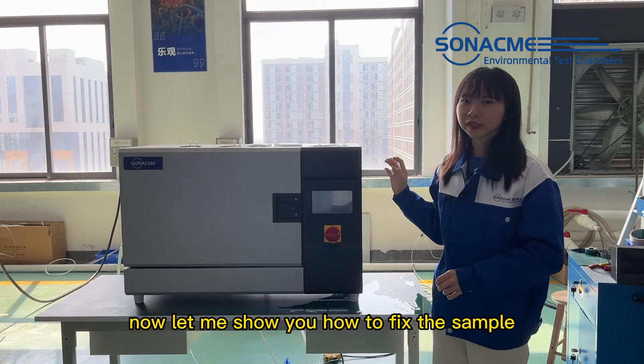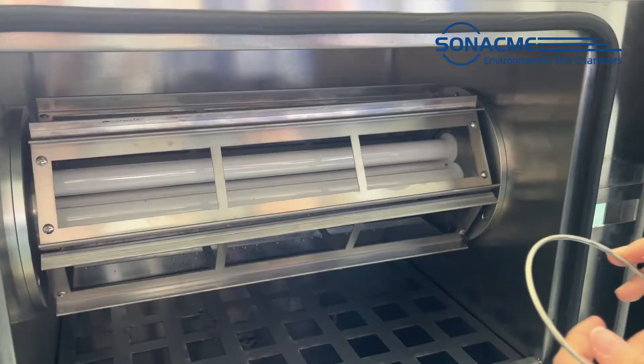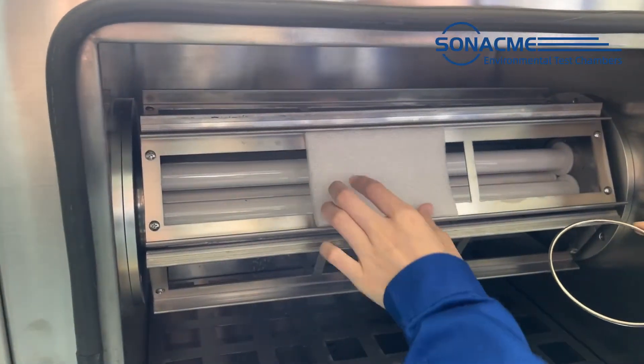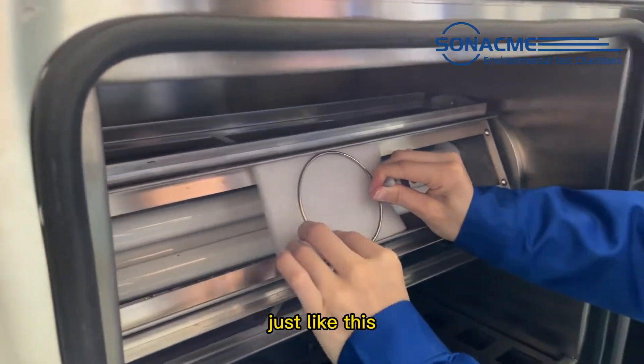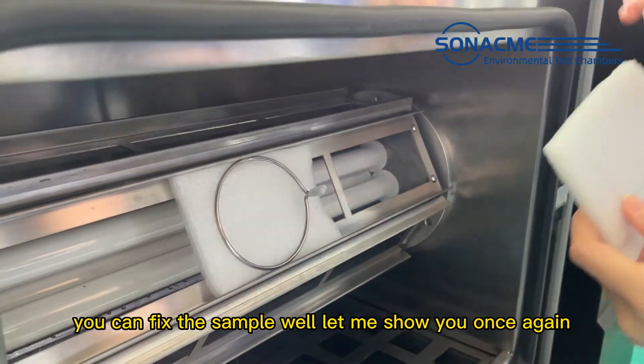Now let me show you how to fix the sample. Open the door. This is our sample clip, and this is the sample — just like this. You can fix the sample well. Let me show you once again.